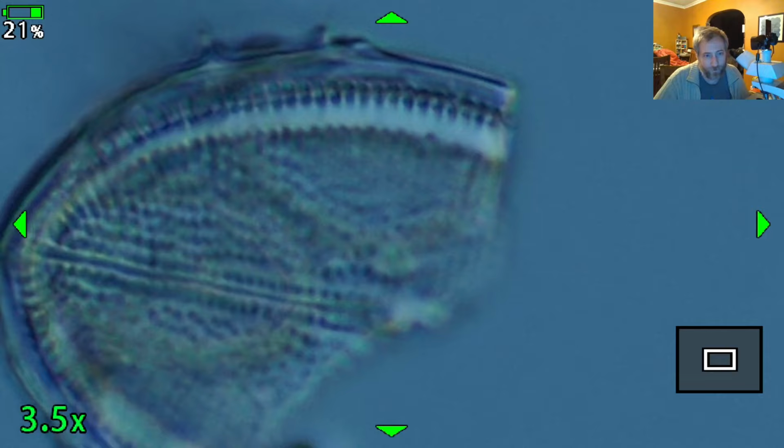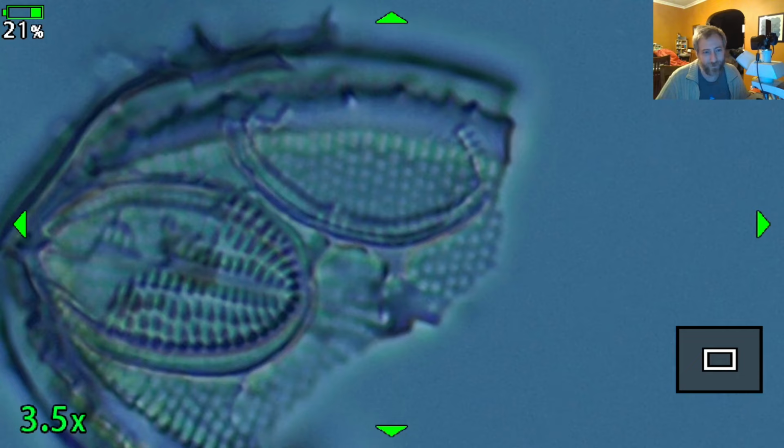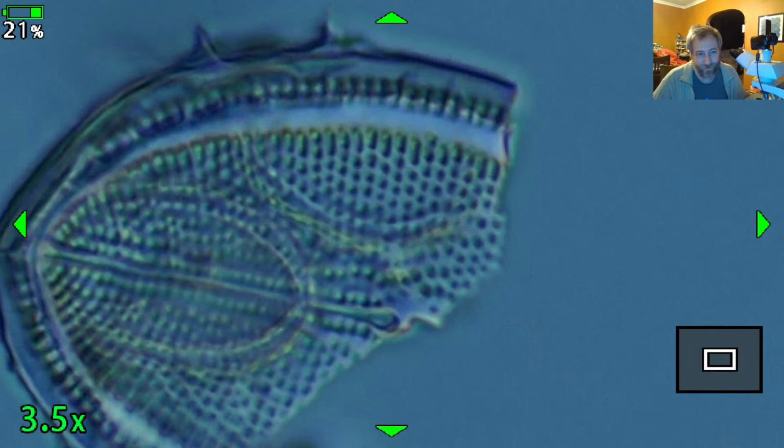But if you look closely, you can see that there are little oval diatoms that have colonized the dead diatom frustule of a Cocconeis, and they are a different species of Cocconeis that are growing on that frustule as an epiphyte. So these little guys are attached to that other valve. Same genus but different species, and they're using the big one's dead body as a place to colonize and live. Kind of cool. So we get the little Cocconeis living on the big Cocconeis. Kind of neat.